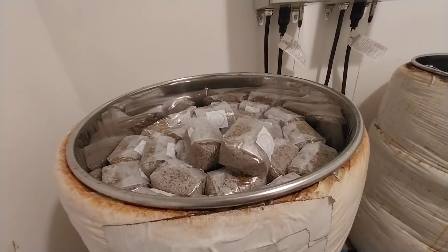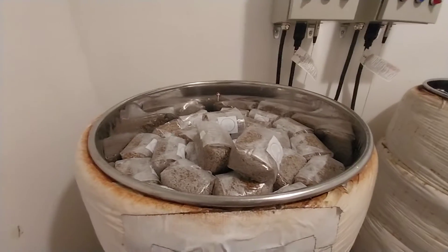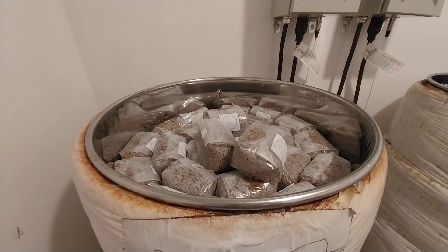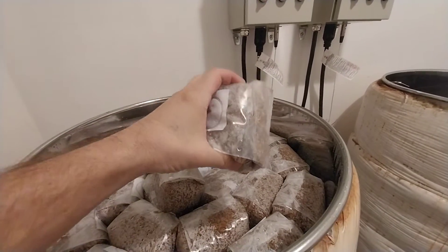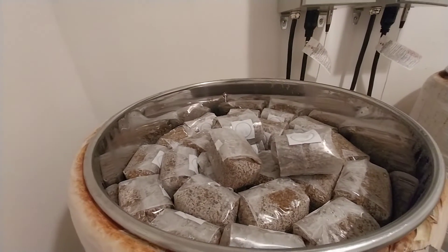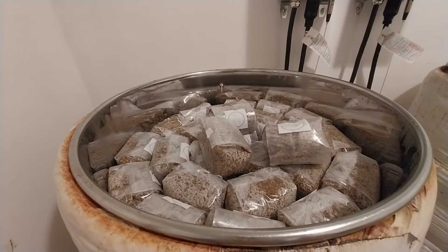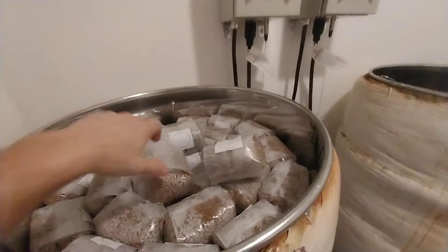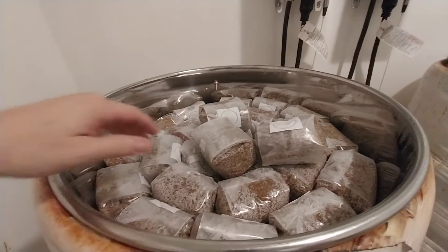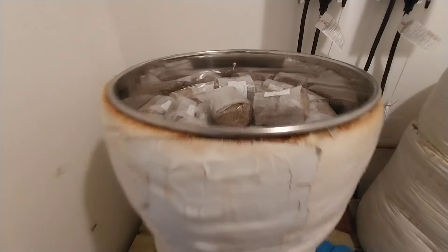We did not plan on using these like this. Initially when I designed them, we were going to grow mushrooms for money — that was the hobby I was in. But we got into biobanking and culturing, and we really just ended up using these to make grain spawn for ourselves at first.